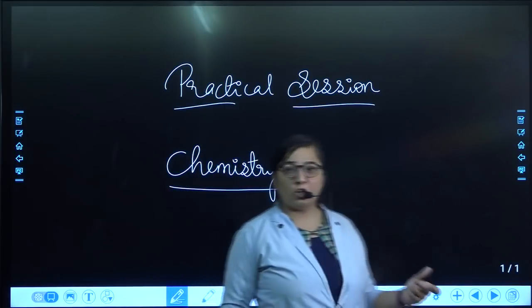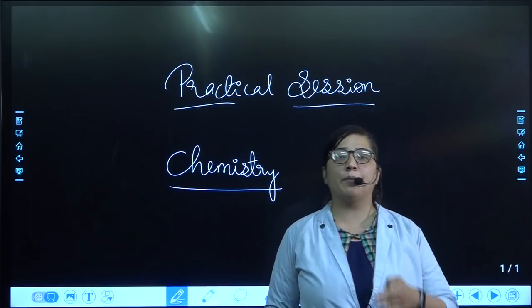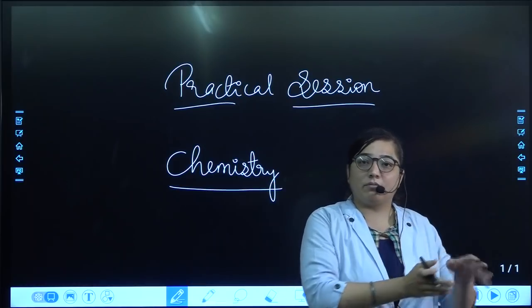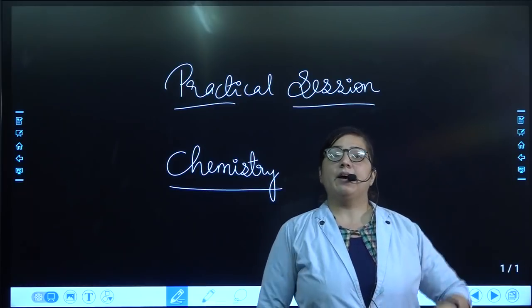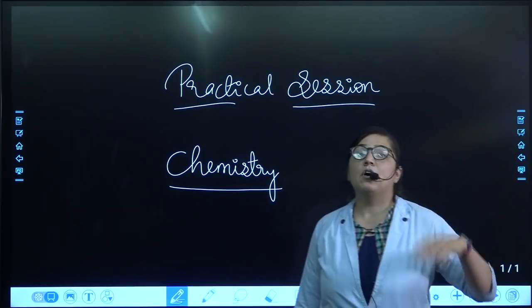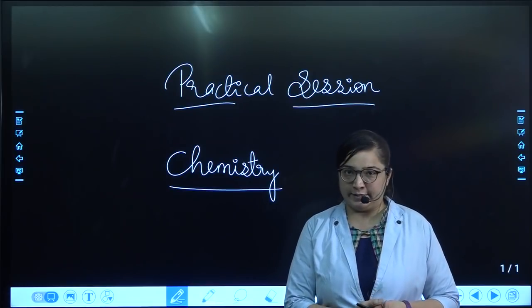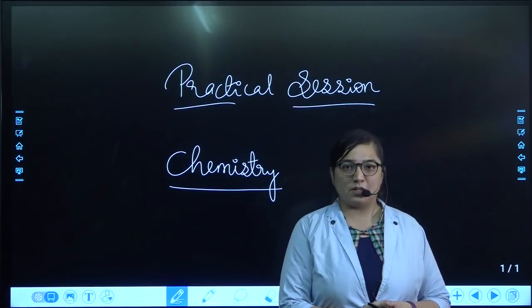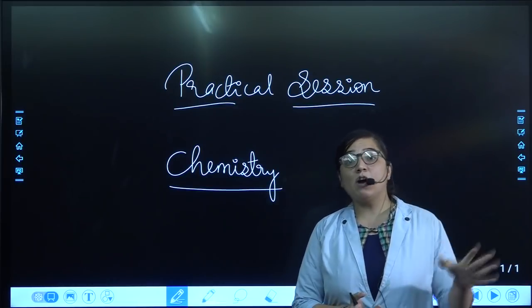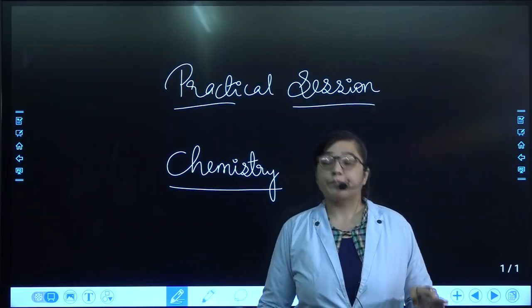The particular topic that we are going to do is not only going to come in class 8 or class 10, it is also going to come further in the chemistry of your further studies, that is of 11th and 12th. We are going to observe some of the very important things that you have already studied in your class 8 chemistry.